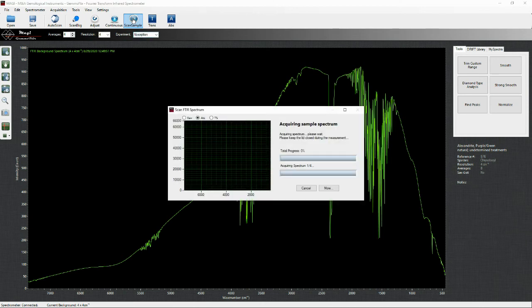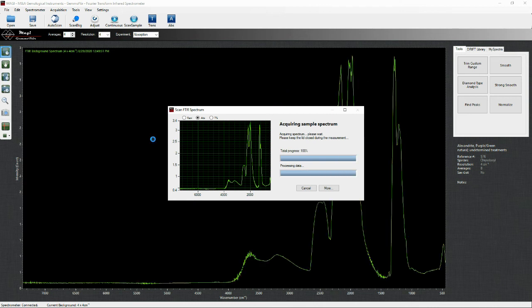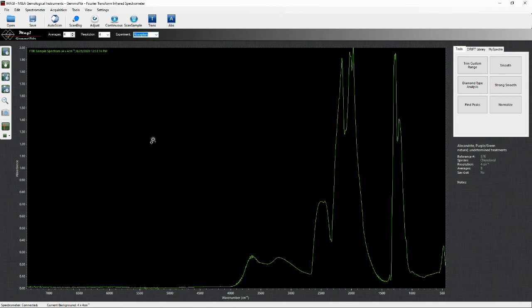Since the background spectrum can be essentially influenced only by the environment conditions like humidity and carbon dioxide concentration, usually it is not supposed to change in a matter of a few hours. If the operator workflow includes a number of scans in that time frame, it will not be necessary to run the background more than one time, and the samples can be tested by clicking only on the Scan Sample button. This will save lots of time and could be critical in case of parcel testing.